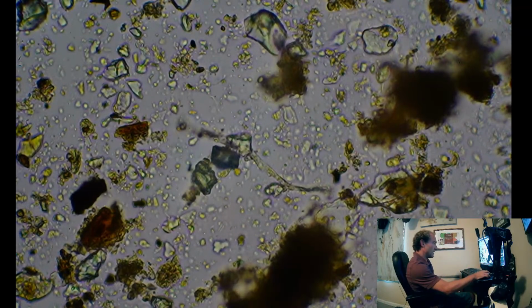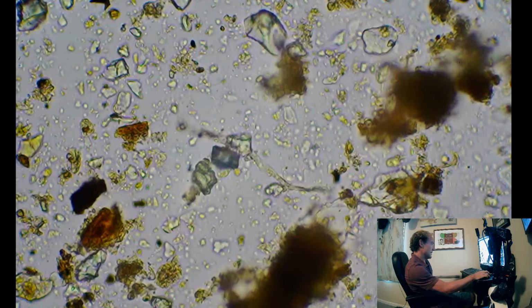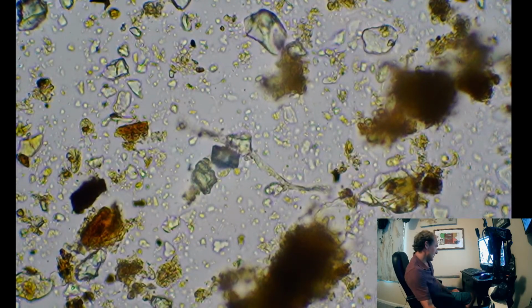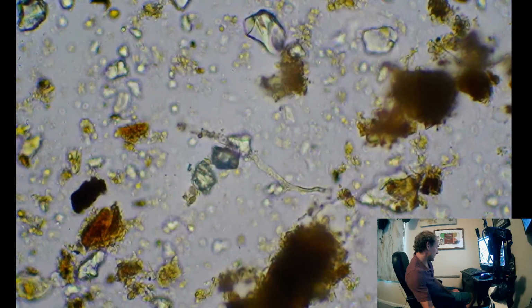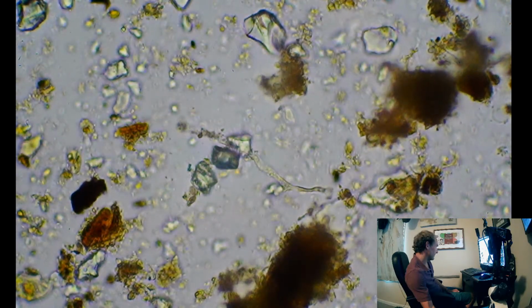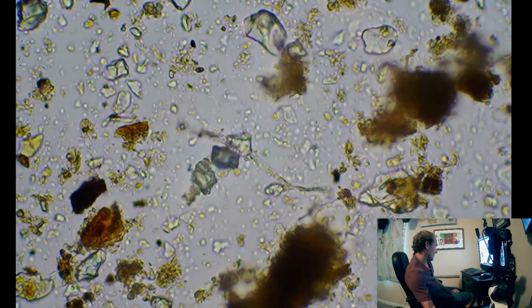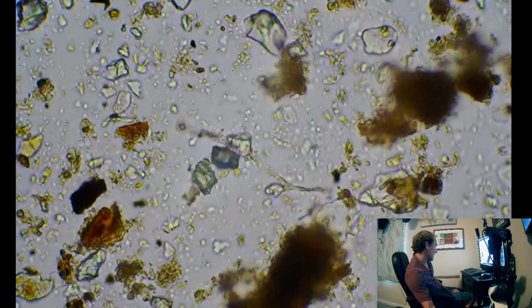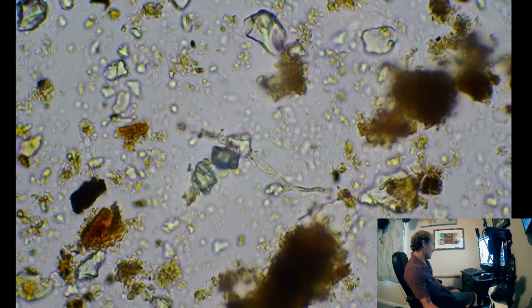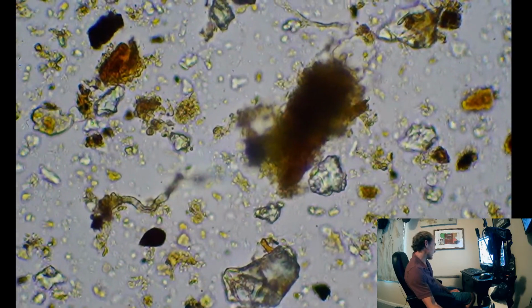Maybe we can get a little bit more definition. Bump up my ISO a little bit. And a little bit better. Need to outcompete those with more good fungi.